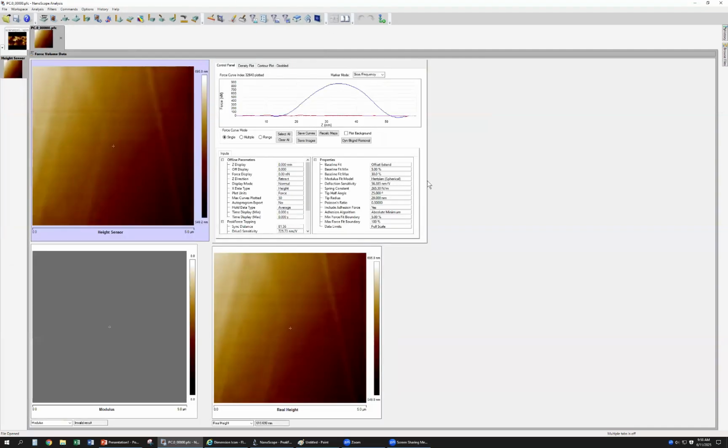In this image, it includes all the first curves. Let me see. This first curve is not correct. How can you see this first curve is not correct? Normally the first curve should be like this, right? But the first curve is like here. The reason is when you subtract your background, the background subtraction is not correct.